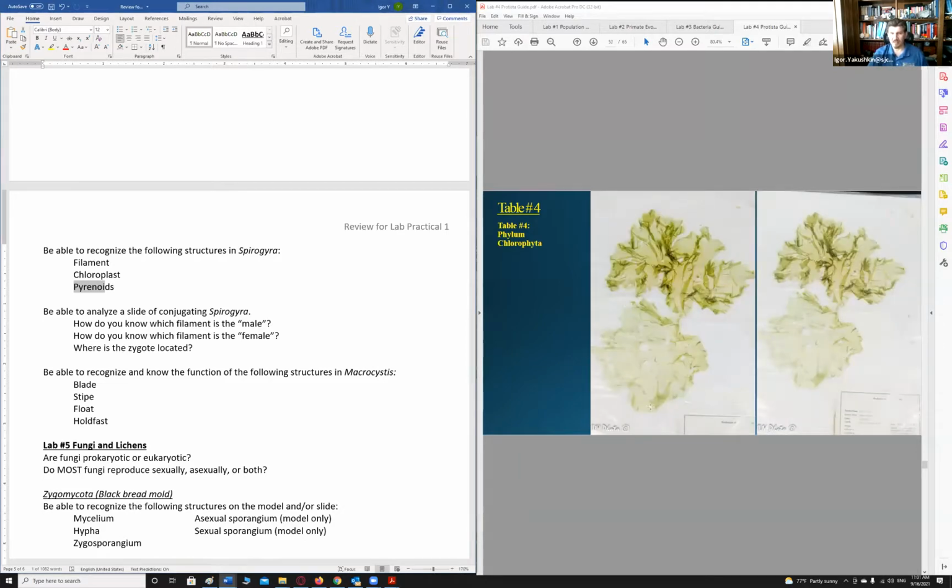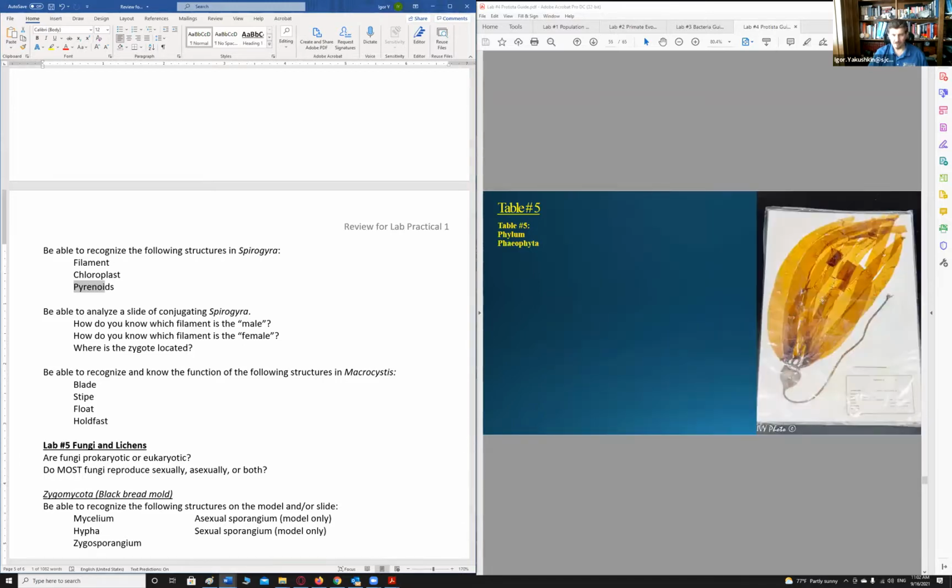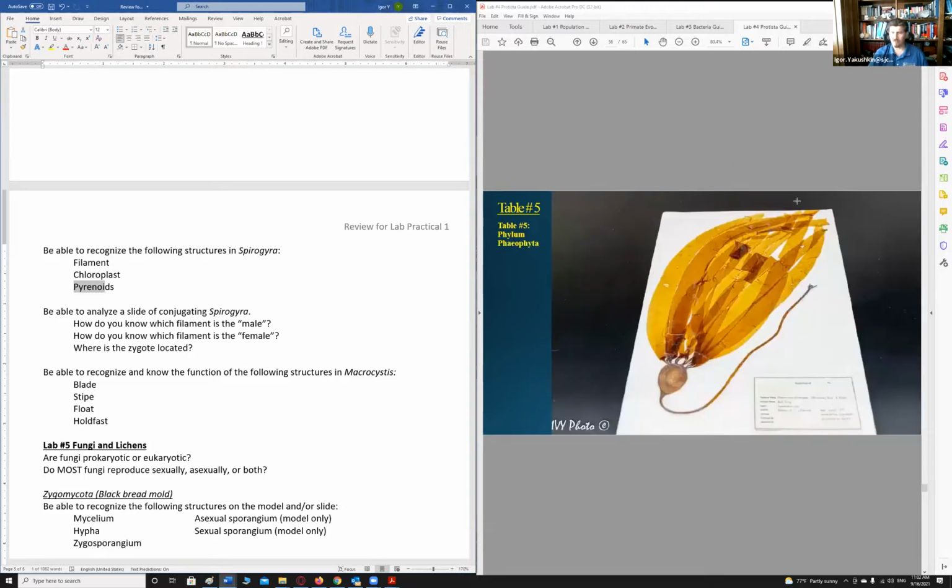Okay, here we have a sea lettuce, also known as the ulva. You can clearly see why it's called sea lettuce, so green algae. So now the macrocystis, right, here we go. On that particular slide, you'll need to be able to identify the blades, and the function of the blade is photosynthesis. Now we have the holdfast, basically roots, they're not roots, they're just holding the whole body of the algae in place, attached to the substrate, the bottom of the ocean, so to speak.